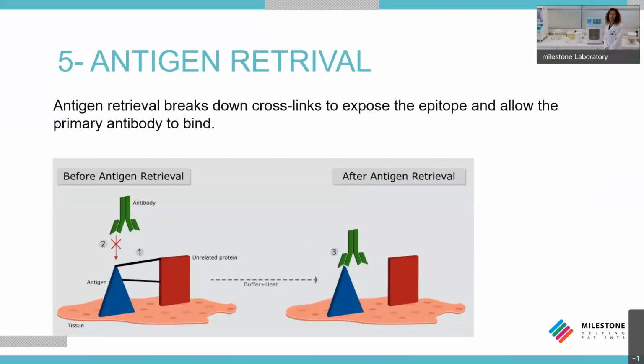And how about the antigen retrieval application? During the past 25 years, immunohistochemistry has progressed from a technique that was limited to specialized laboratories with strong research backgrounds, to a technique that is commonly performed in most pathology laboratories.